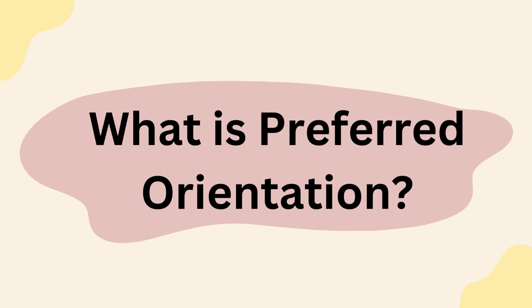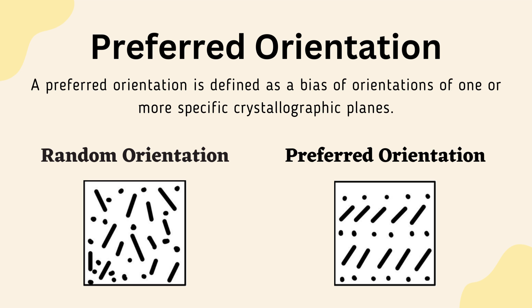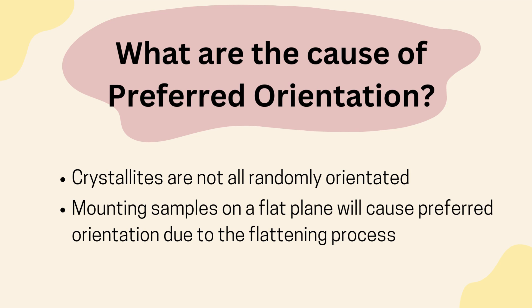What is preferred orientation? The preferred orientation is defined as a bias of orientations of one or more specific crystallographic planes. The causes of preferred orientation are: crystallites are not all randomly orientated, and mounting samples on a flat plane which will cause preferred orientation due to the flattening process.